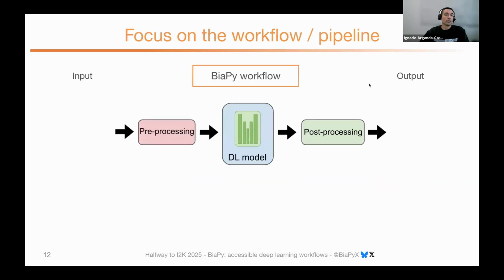Okay, so how does it look? As I said, the core of BiaPy is the workflow, and the structure is the same as I showed you before from Kota. We have basically divided our platform into 3 different modules. We have pre-processing, the deep learning model to do either training or testing, and then the post-processing module.